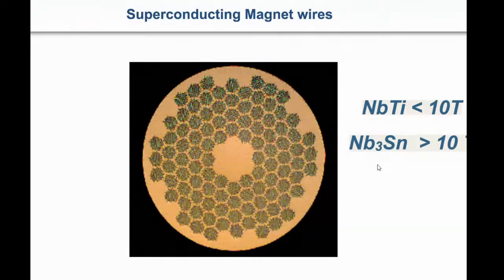The frequency depends on the B0 magnetic field. If the frequency is different at different places in your sample, then a single nucleus in the same environment will give multiple signals depending on its position in the sample. That is not desirable. A single nucleus in a particular chemical environment should give you a single peak, right? That is the uniqueness of NMR. If you have multiple peaks, then you have a problem. It is actually good for MRI, but not for high resolution NMR.